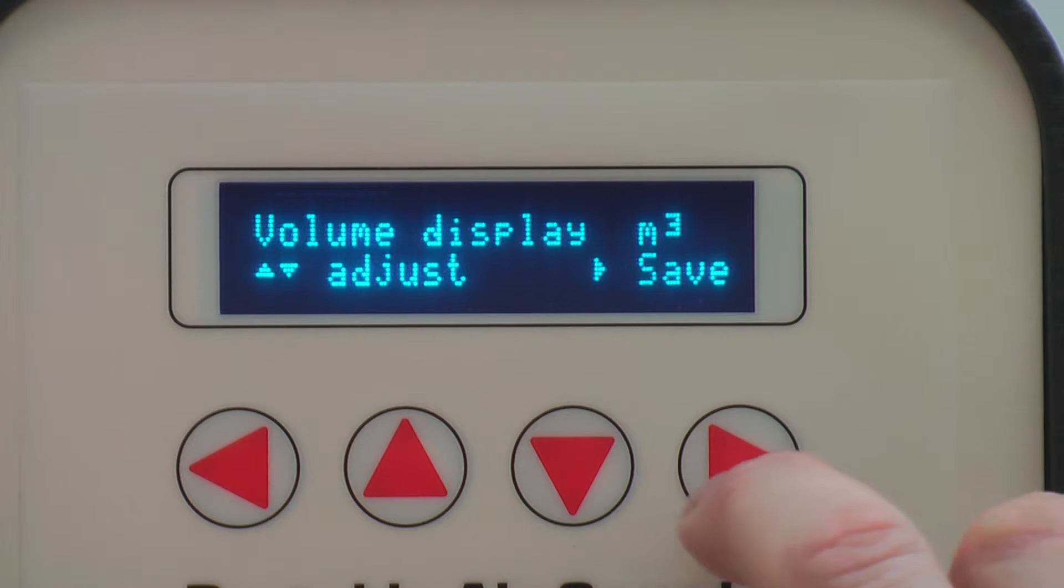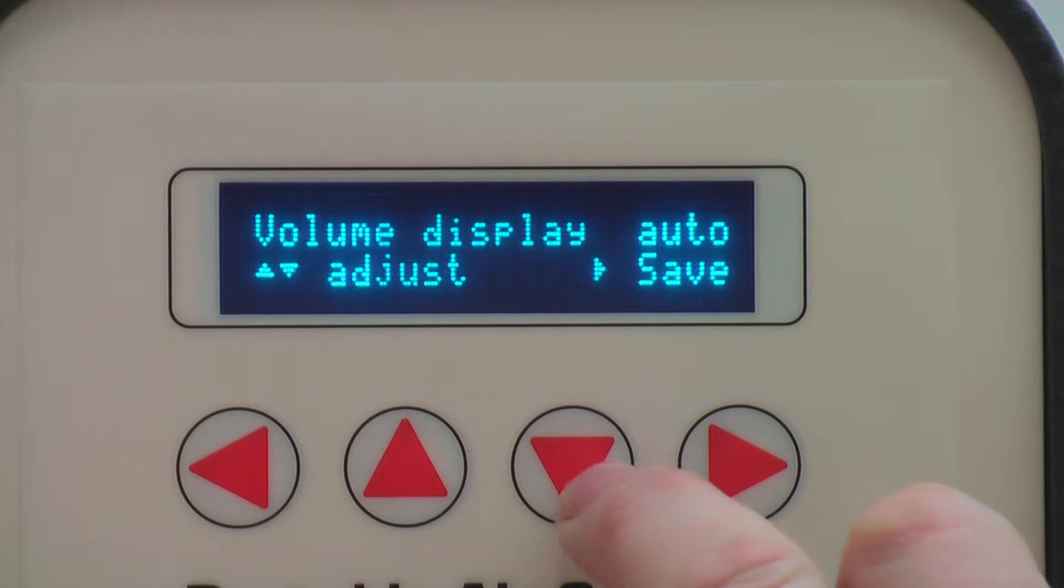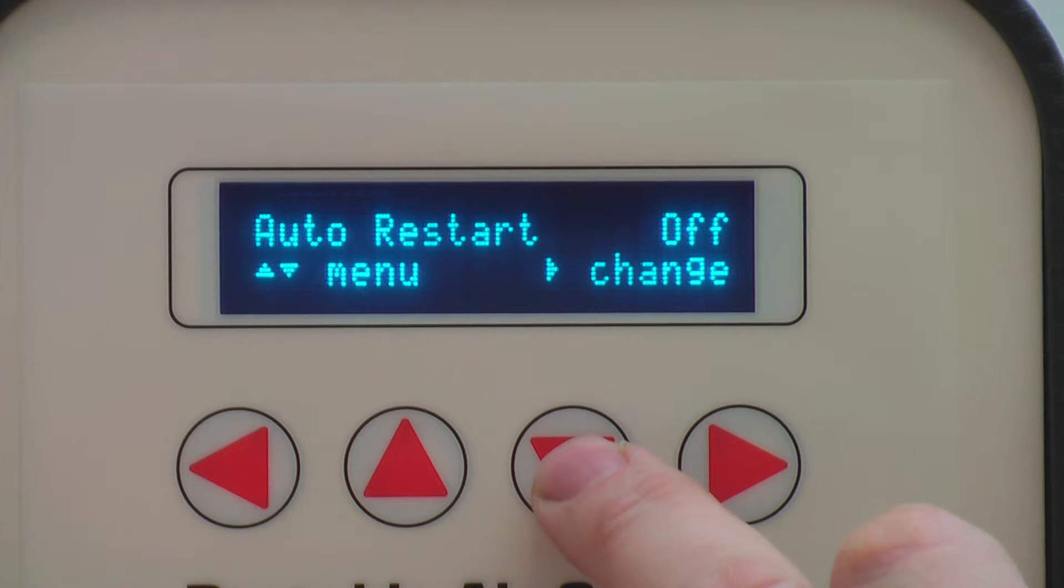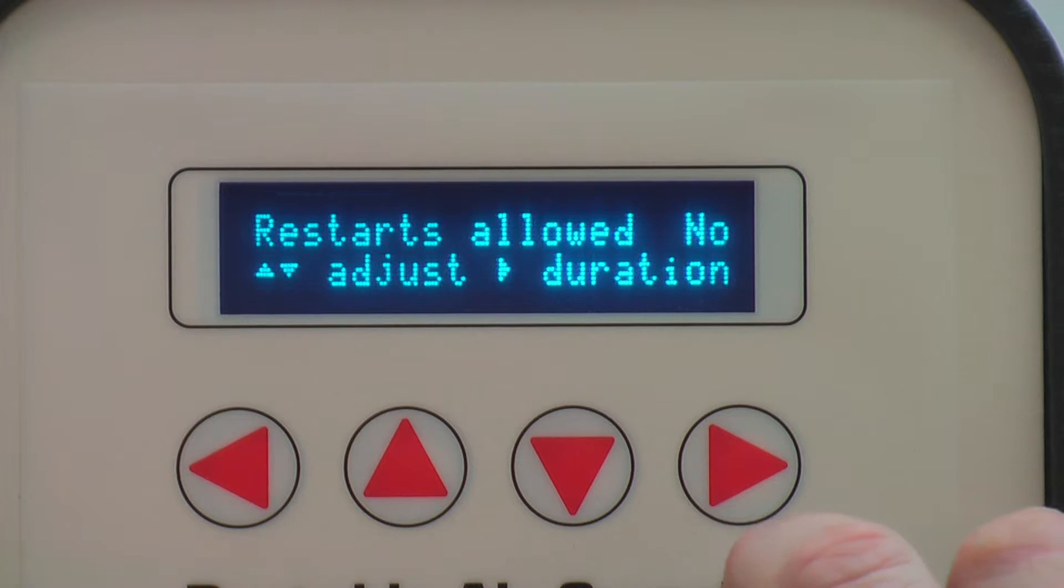Flow rate can be displayed as meters cubed per minute or liters per minute, or you can configure it as auto. Change the volume display to your preference by pressing right and using up and down arrows to cycle through the units. Once you are happy with your configuration, press right to save.